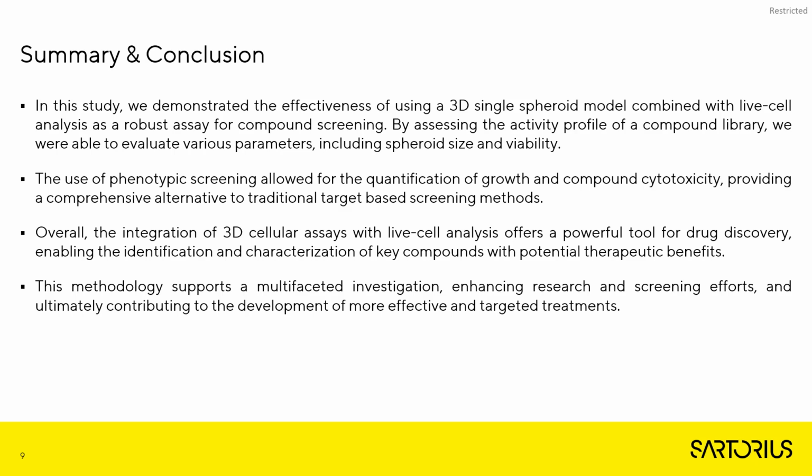The use of phenotypic screening allowed for the quantification of growth and compound cytotoxicity, providing a comprehensive alternative to traditional target-based screening methods.